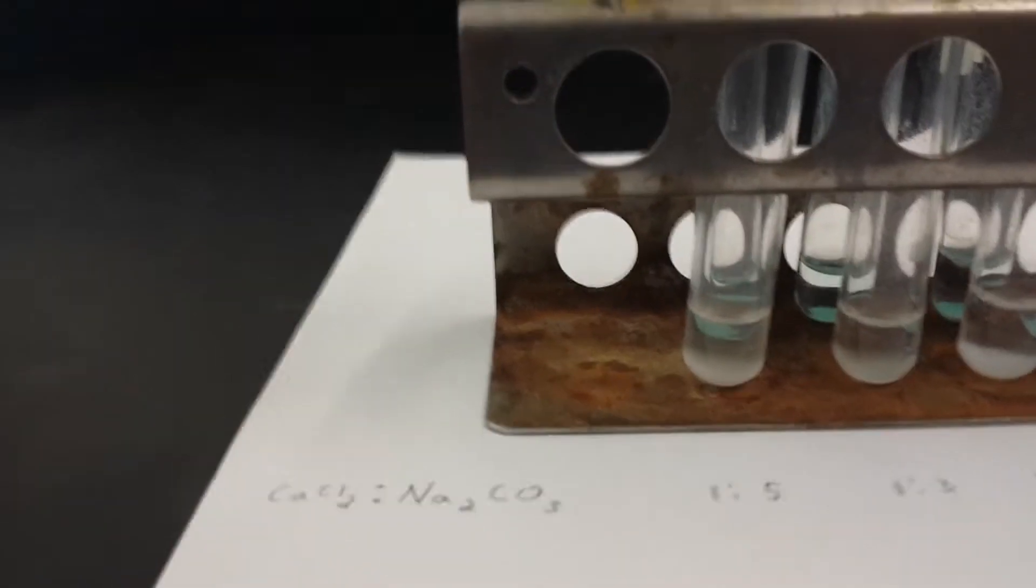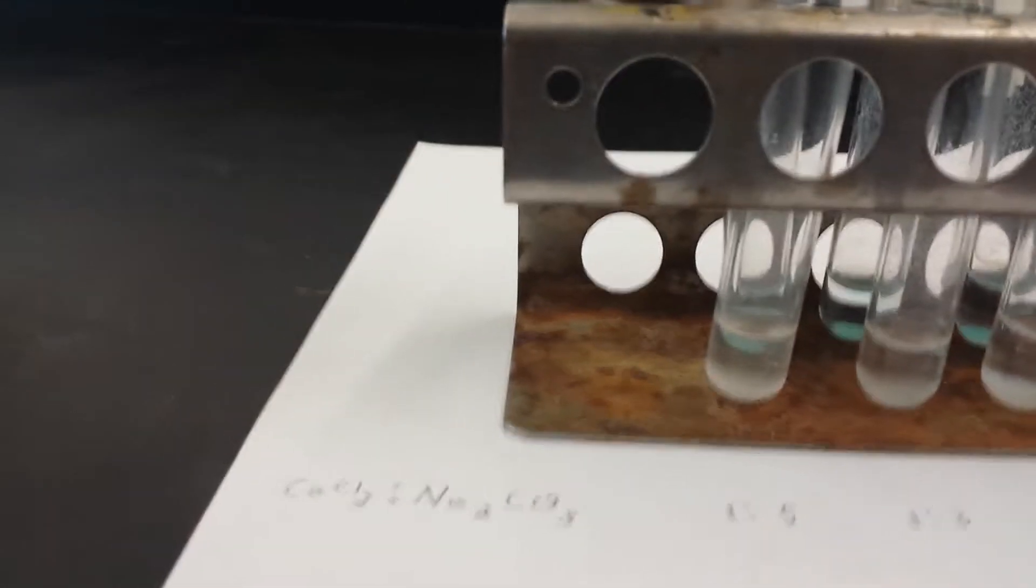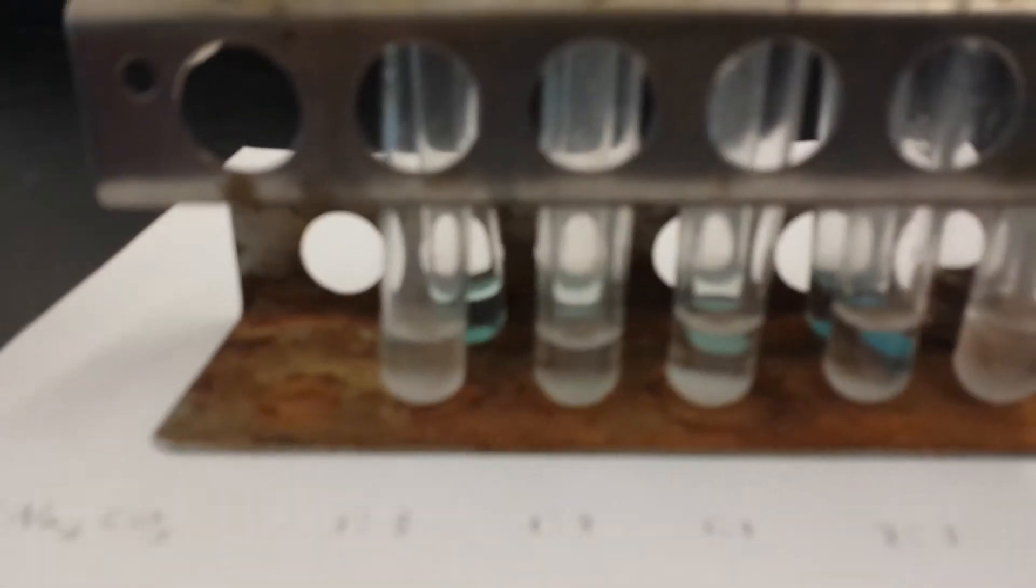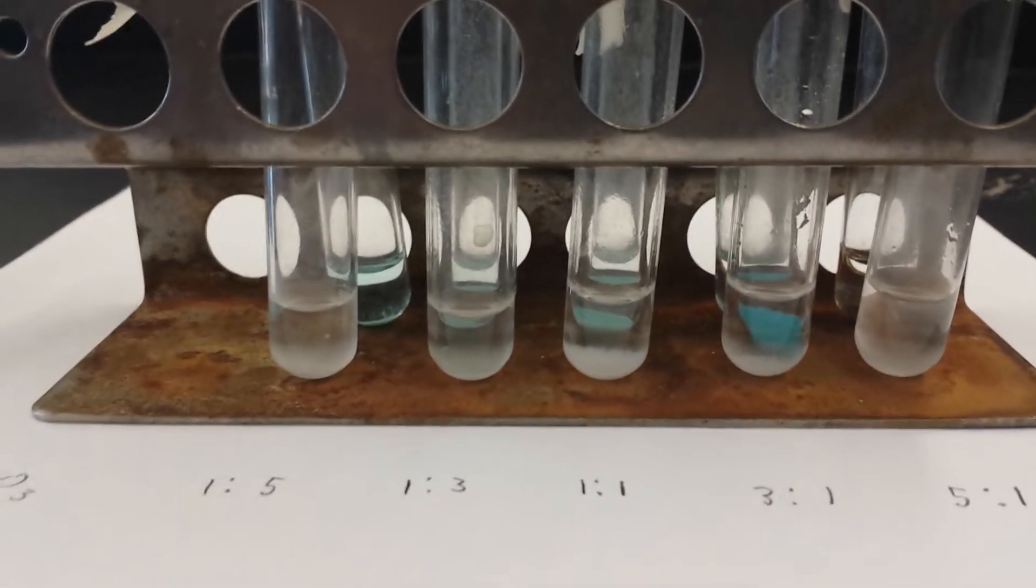Okay, in lesson 24, we see that when we mix different numbers of drops of calcium chloride and sodium carbonate, we get different amounts of precipitate.